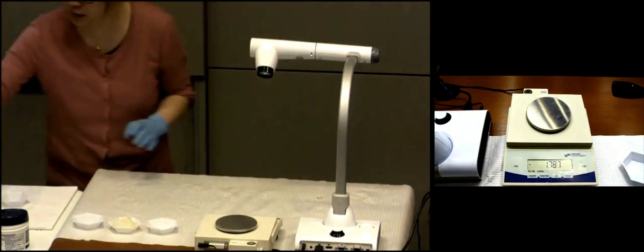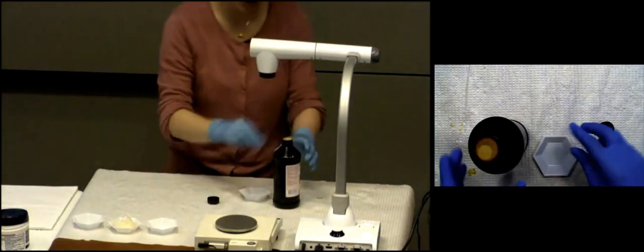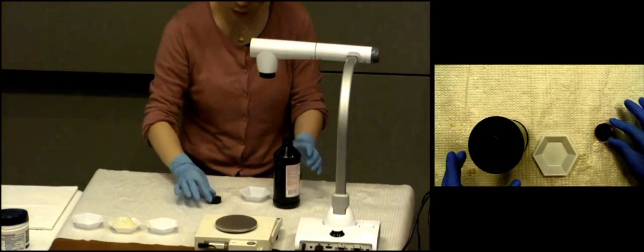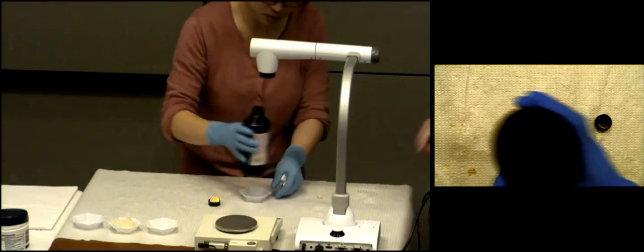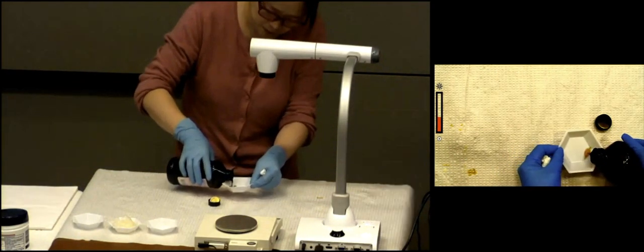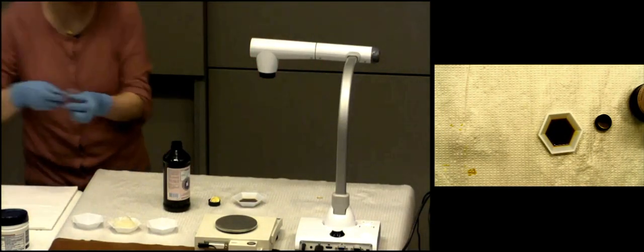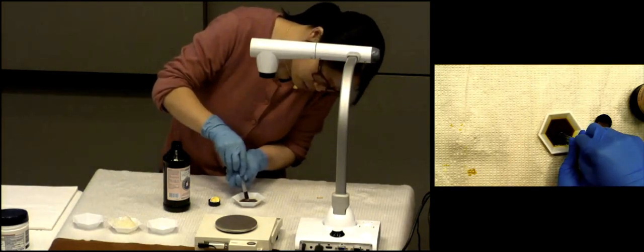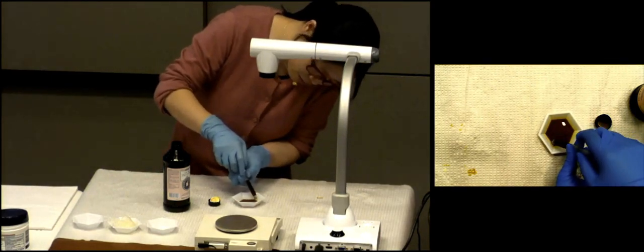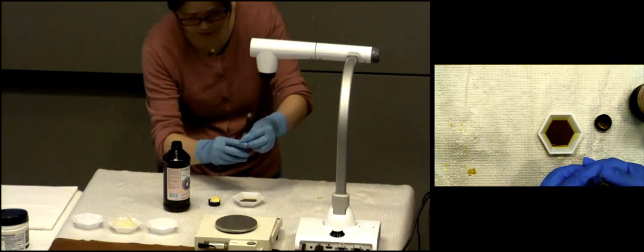So the next one is LCD. We are going to measure by volume. So let's use a weigh boat to pour some out. And let's set up a volume. So what is my target volume here? 1.9. Okay, so let me get more than what I need. Hopefully this won't be the splash zone in the front row again today.